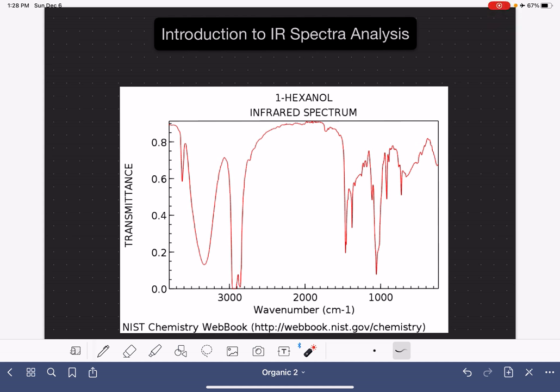In this video, I'm going to give you a very basic and brief introduction to the steps that you should take when you're analyzing an IR spectrum. We're going to be using the spectrum of one-hexanol, which I got from the NIST website.